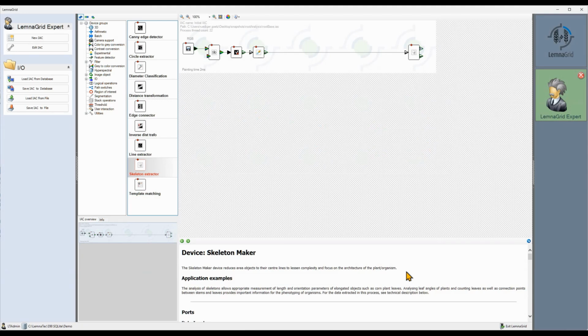Now let's come back to the segmentation. Depending on the quality of your original segmentation, you may have some issues with false detections, far away from the main root, and spurious side roots, where the detected roots grow suddenly a bit wider for a few pixels. See the following example.